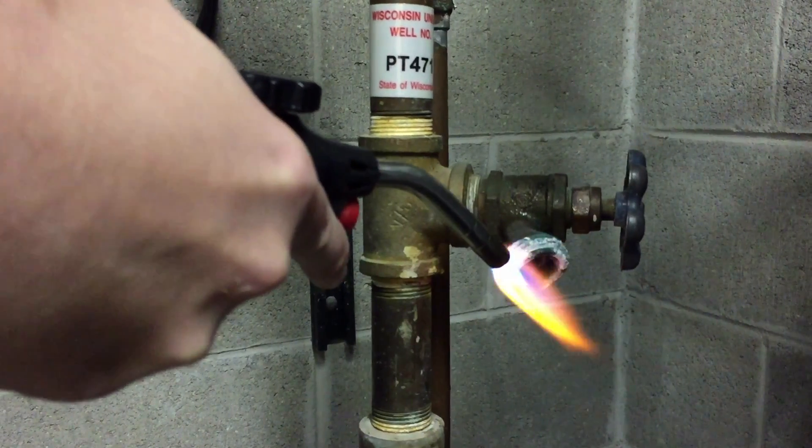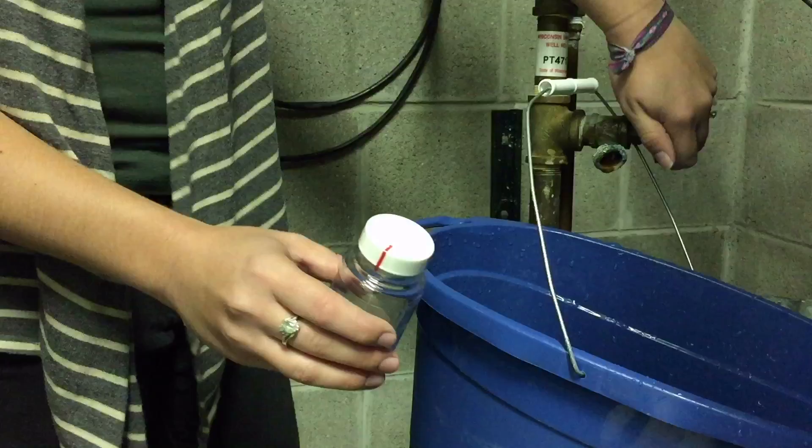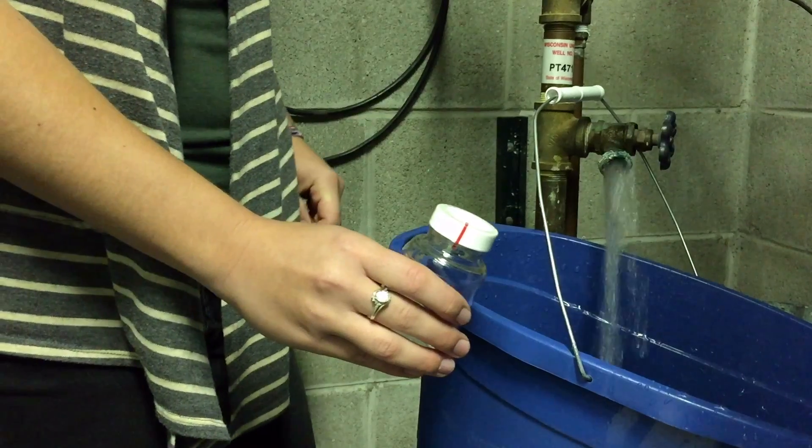Then you want to turn it off and heat it up with a lighter or a torch for 10 to 20 seconds to kill any bacteria that might be on the spigot head. Then you'll turn it back on and run it for another 30 seconds.